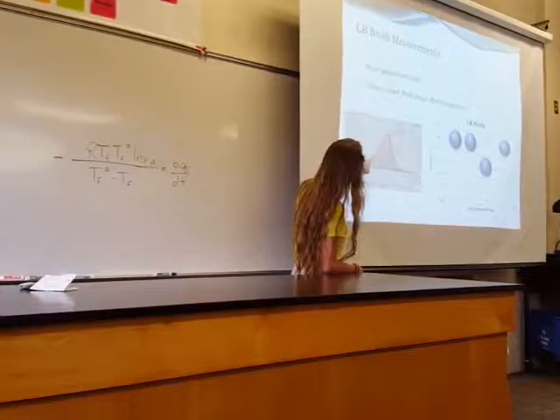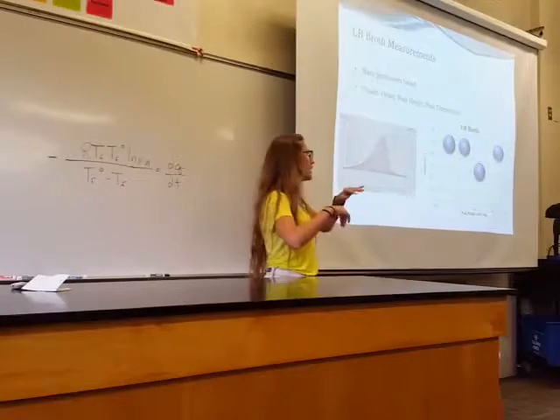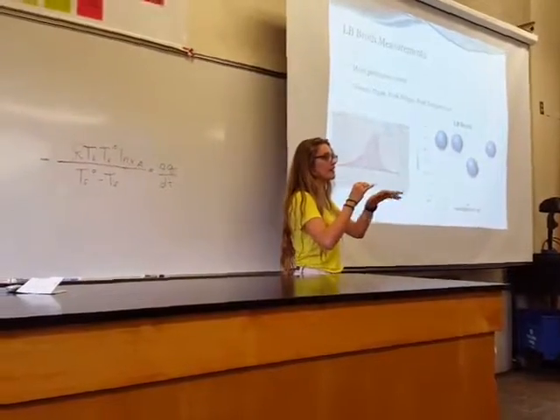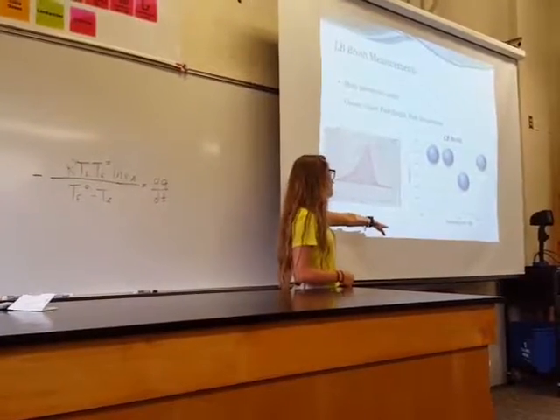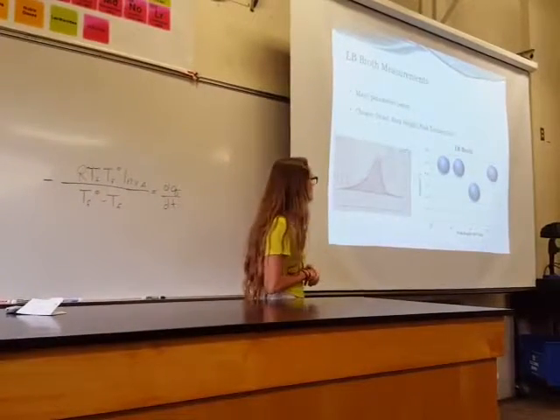This is just showing a few of them for each of the curves. A couple of them were chosen and exchanged on the x-axis and the y-axis, and the ones that were decided best later on when analyzing the LB samples with the bacterial samples was onset on the x-axis, peak height on the y-axis, and peak temperature as the size of the ball.